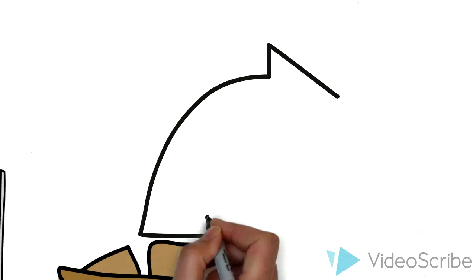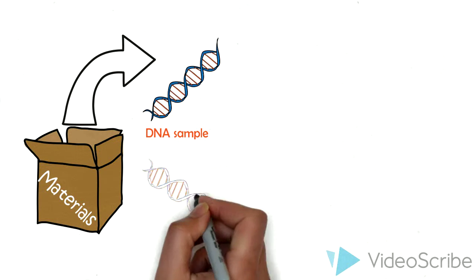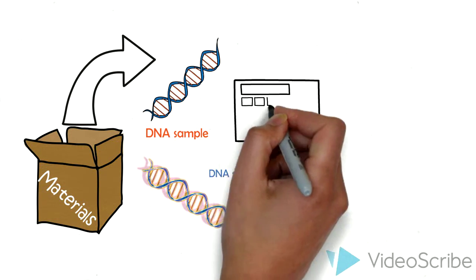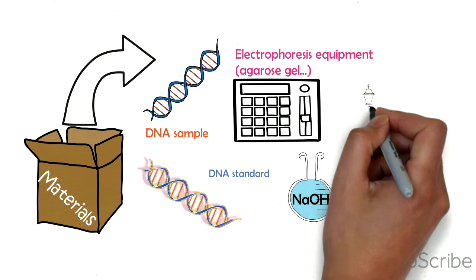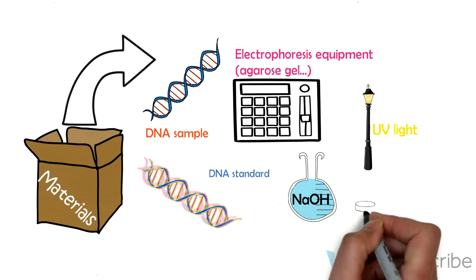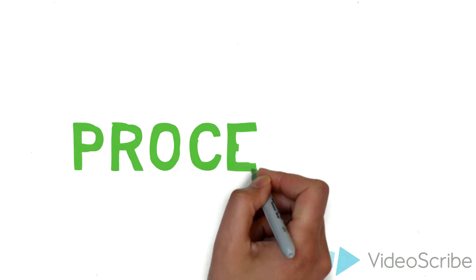Materials: DNA sample, DNA standard, electrophoresis equipment, sodium hydroxide, UV light, ethidium bromide. Procedure.